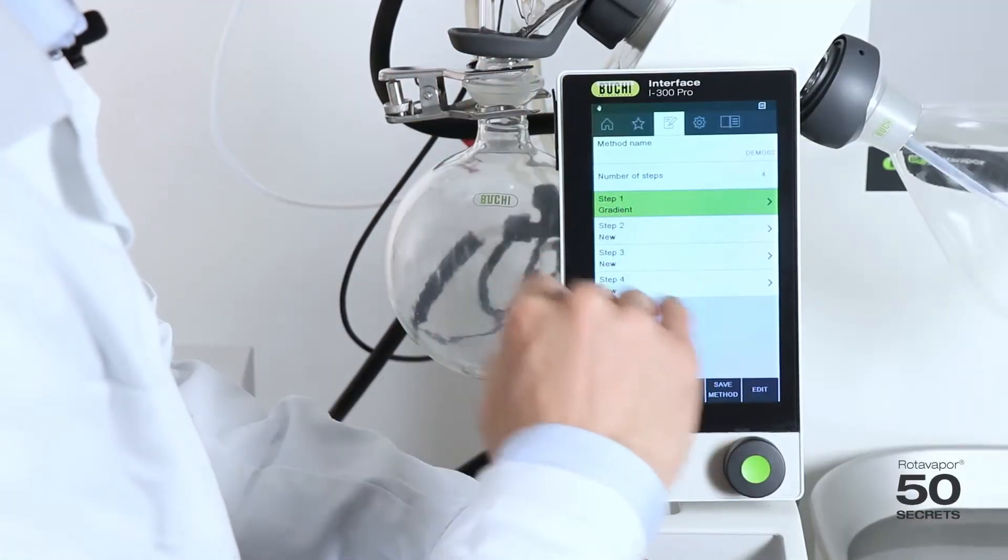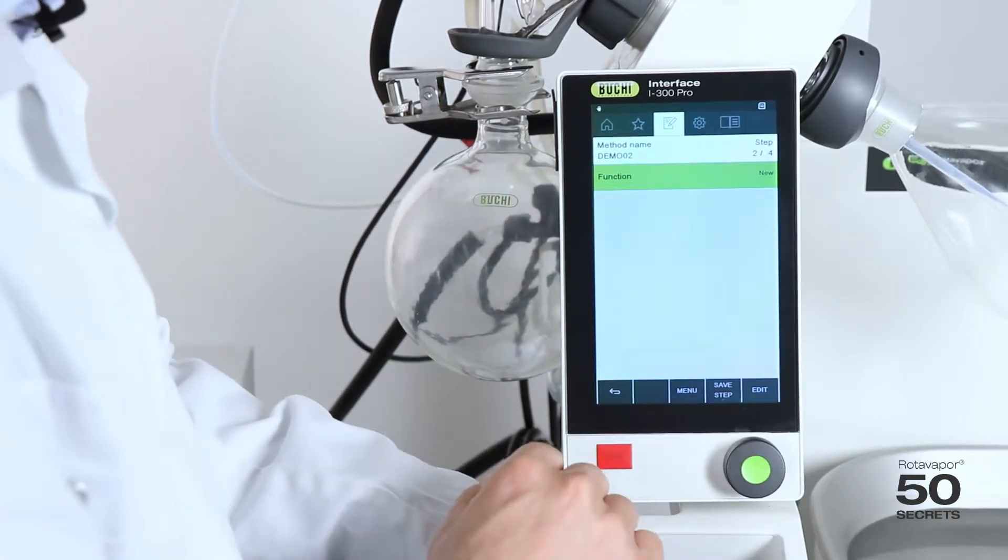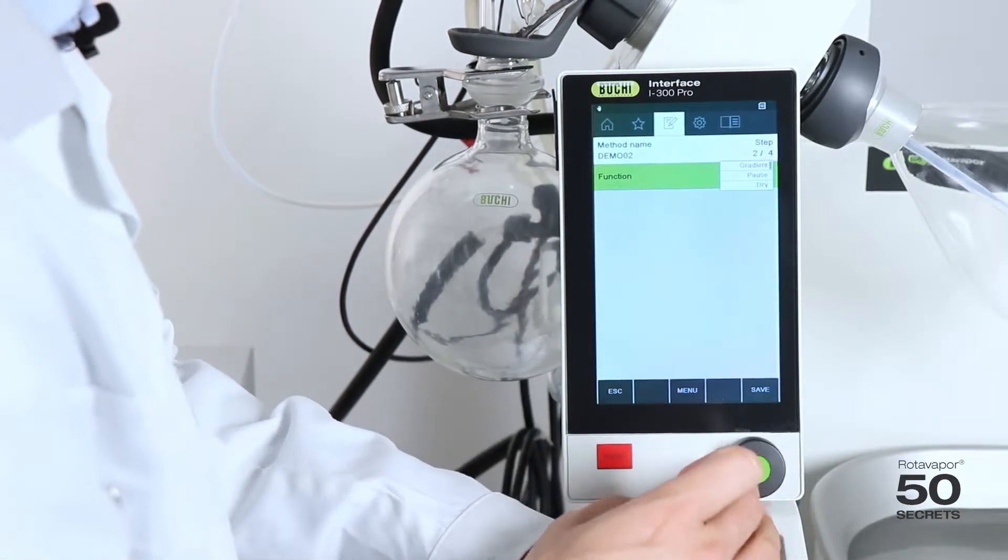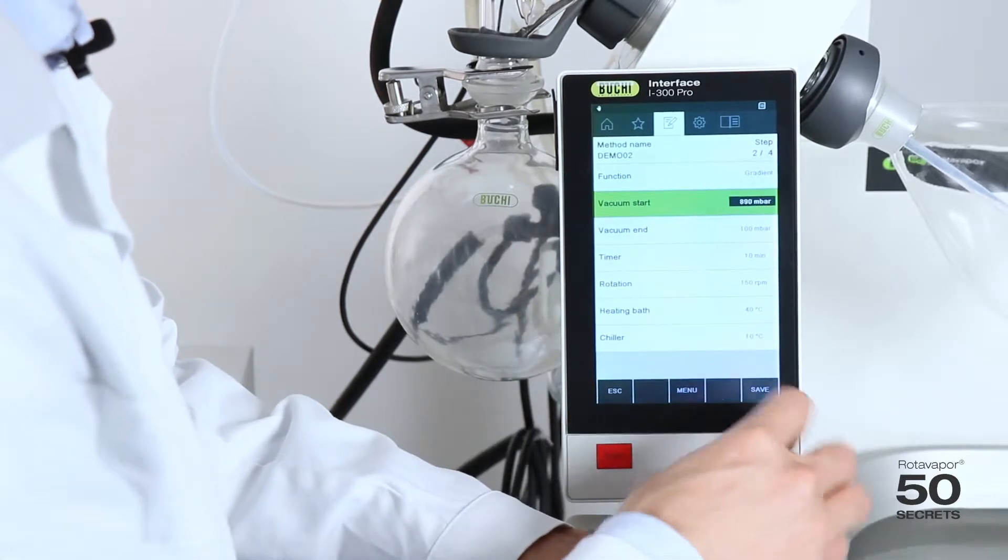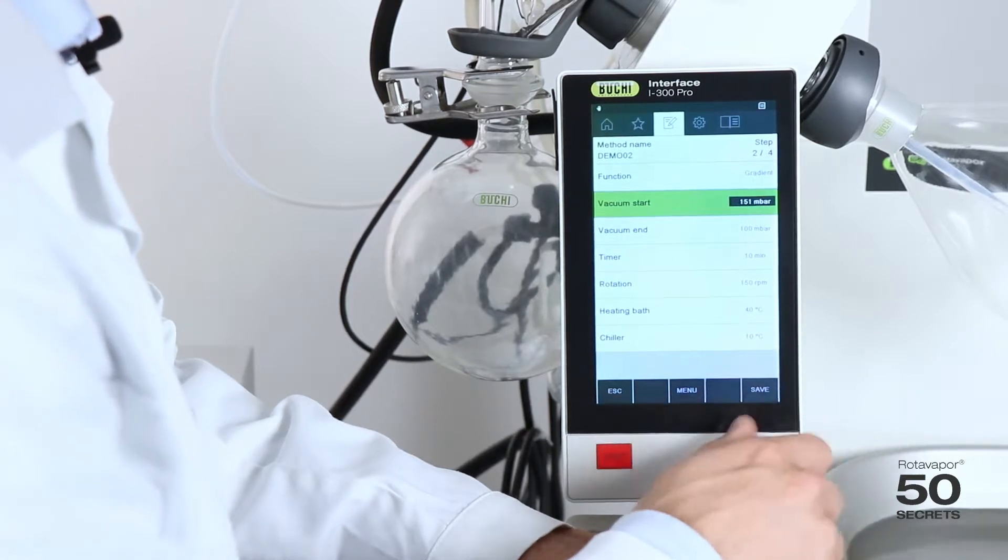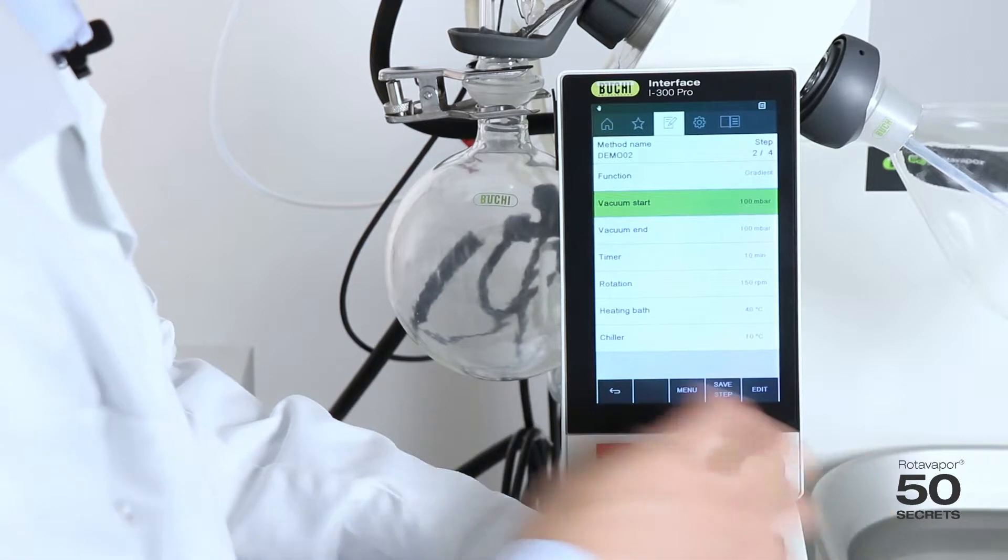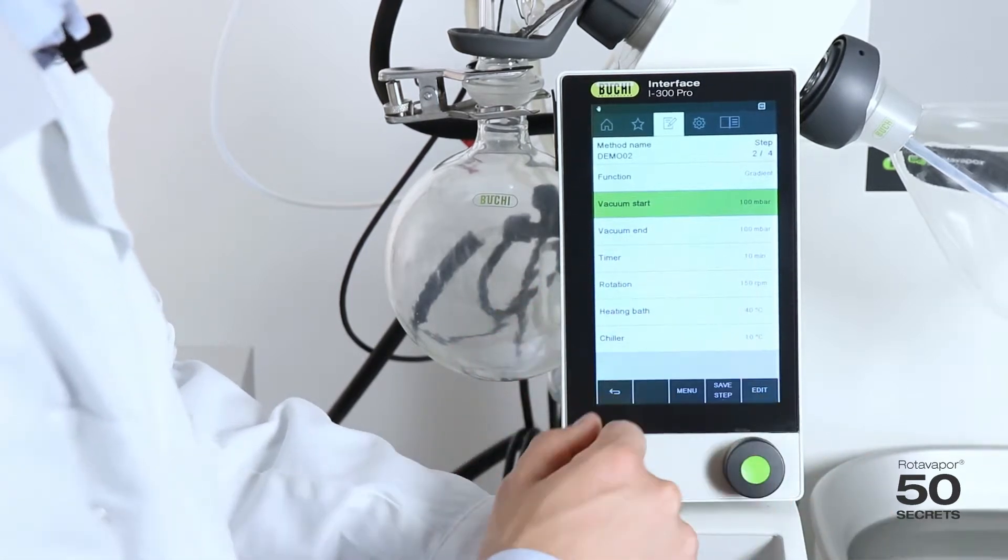The second step now as we are on 100 millibar would be to stay on the 100 millibar for 10 minutes. We choose the same function. It's a gradient again, but instead of doing a gradient we just set the vacuum to 100 millibar. Just do this by using the wheel. 100. Fantastic. The timer 10 minutes. Rotation still 150. Safe.